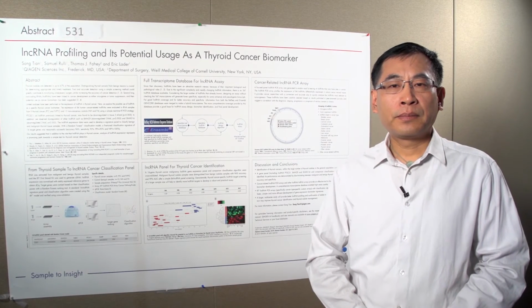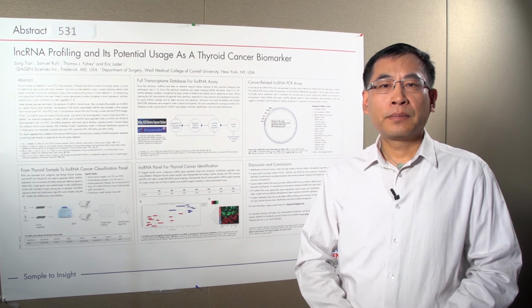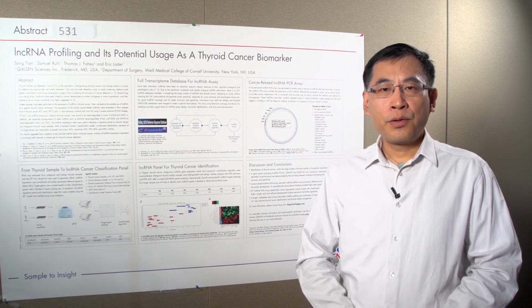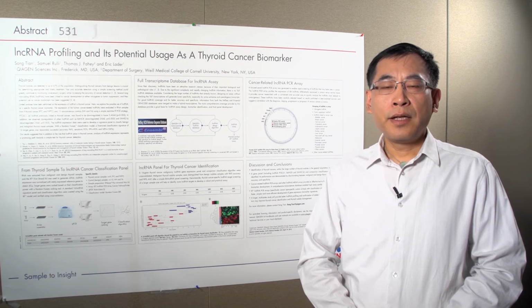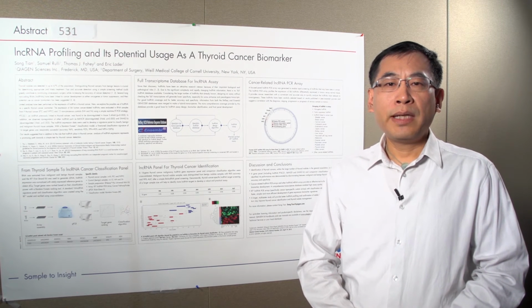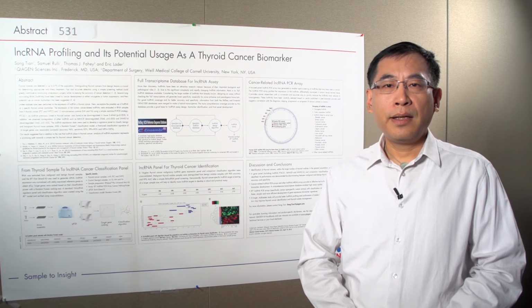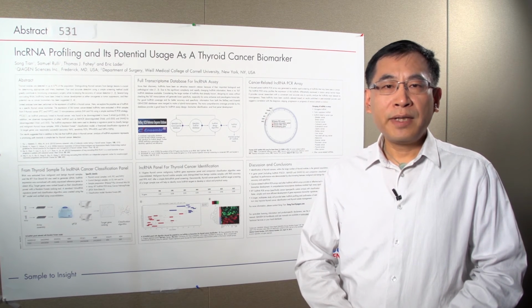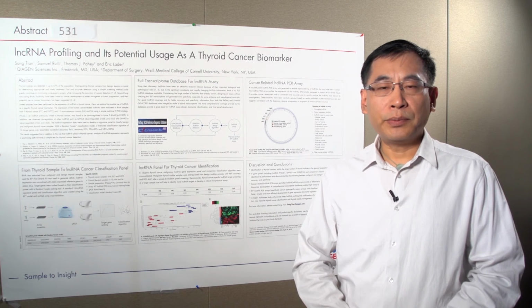Would you be able to generate lncRNA assays based on my own list? Sure, we definitely can generate a custom array based on the customer's gene list. It is better to use genes from RefSeq or Ensembl.